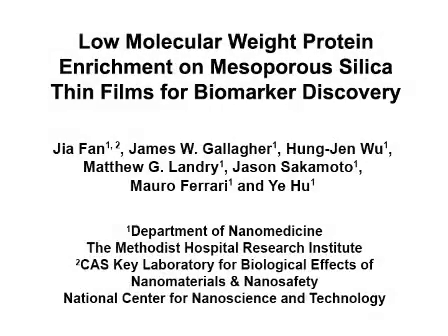The overall goal of this procedure is to develop a technology based on mesoporous silica thin film for the selective recovery of low molecular weight proteins and peptides from human serum. This is accomplished by first fabricating the mesoporous silica thin film chips and pre-treating with oxygen plasma ashing.